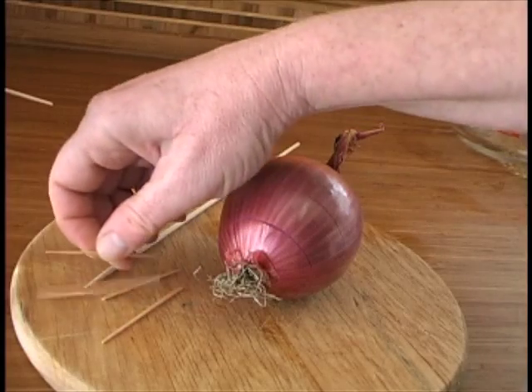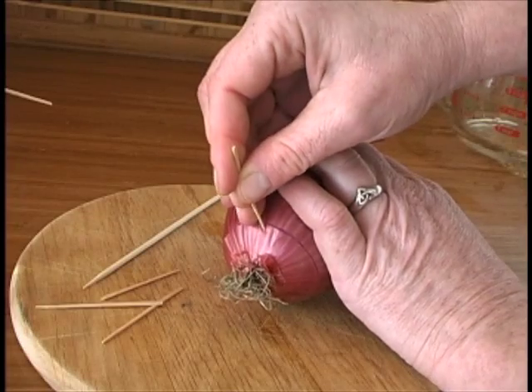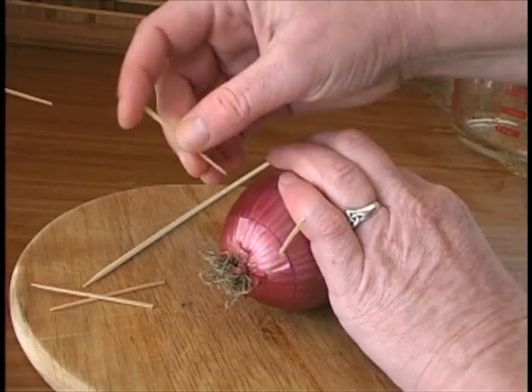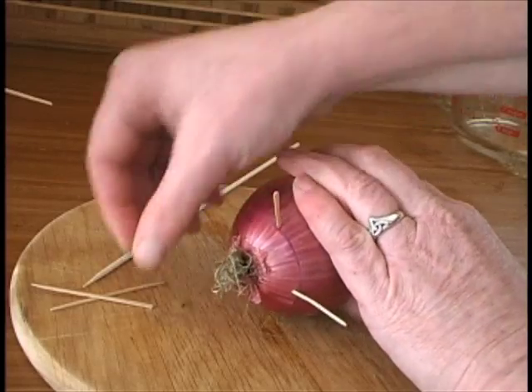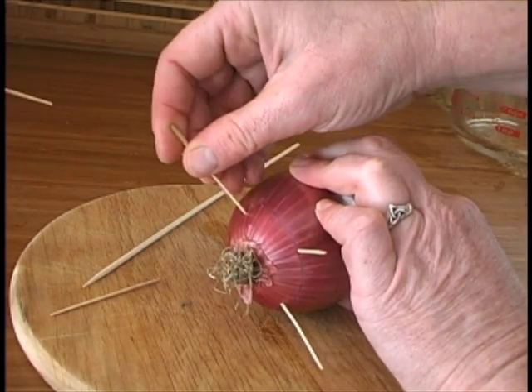Once you've cut your onion, you want to place some toothpicks about half a centimeter up from where you've cut. This is just to hold the onion from falling into the glass of water. Or if you have a small glass, you can just set it right in the glass.